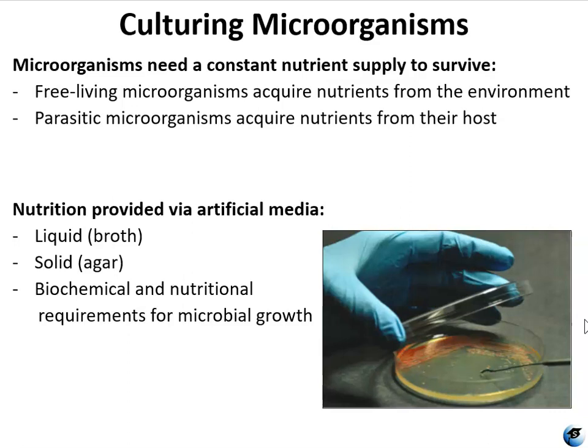The media contains the chemicals and nutrients that microbes need to grow. Media usually comes in a liquid form called a broth, or solid forms. Solid forms are going to be agar plates, slants, or deeps. Liquid broth is very useful for culturing bacterial specimens quickly. That is, the incubation is usually 24 hours or less, so it's faster than growing on a plate. And that is a pro, right?